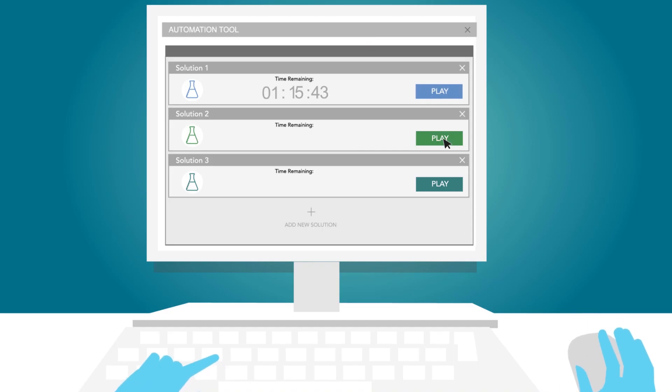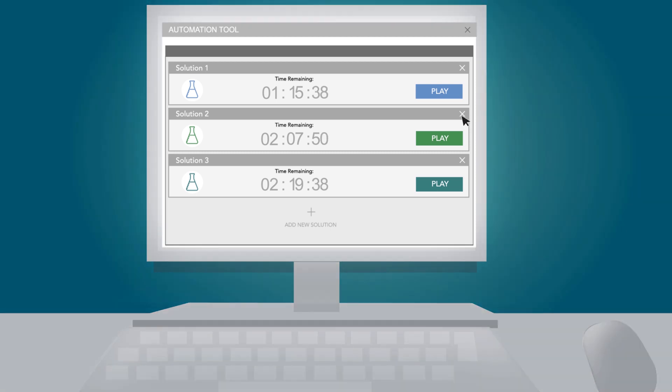ARIA's intelligent software allows you to design the protocol that best fits your experimental model.